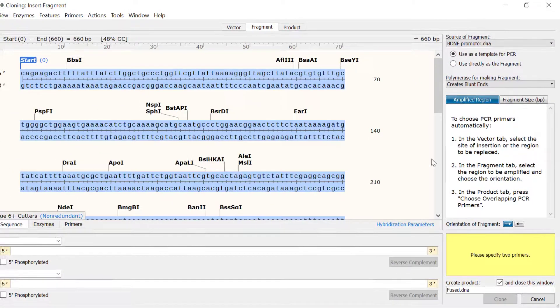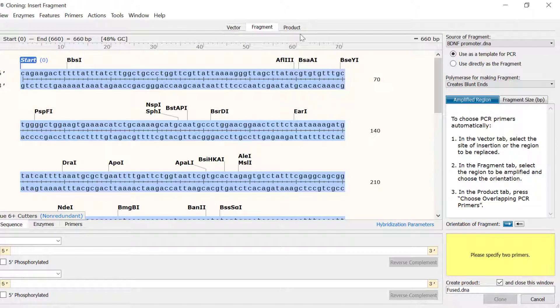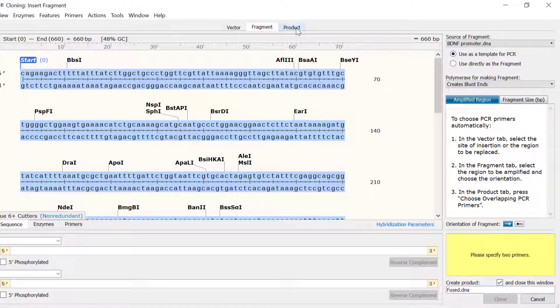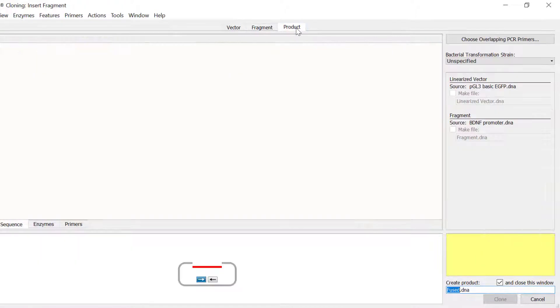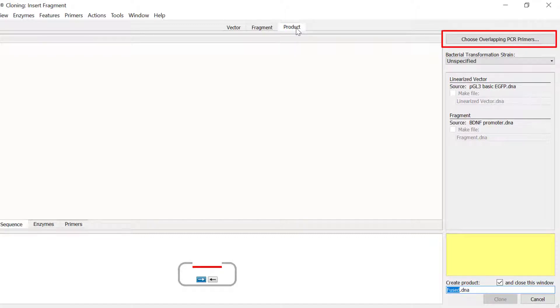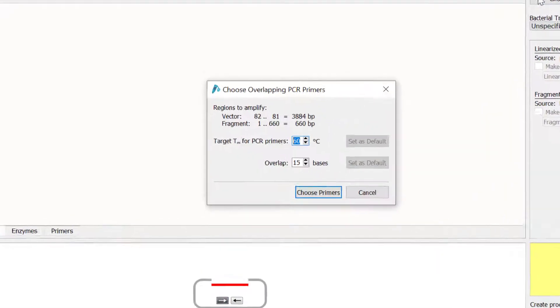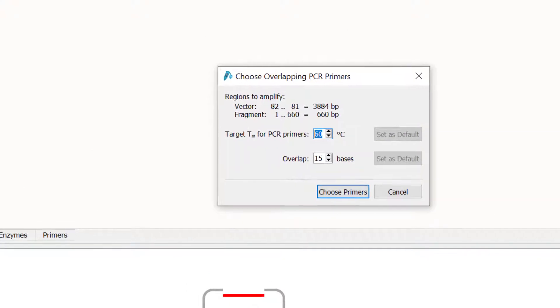Moving on to the products tab, I now need to choose the PCR primers and see a preview of the final construct. To do this, I will select the choose overlapping PCR primers button to let Snapgene design the most suitable primers for this infusion cloning experiment.